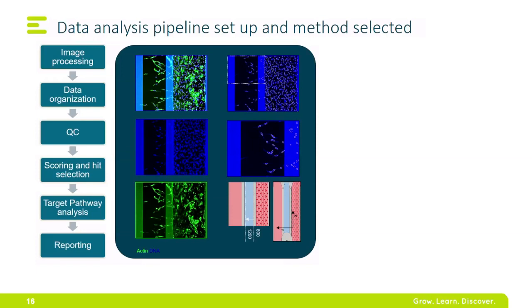On top of that, we also figured out that you have inherent toxicology data in there, because you can look at the main tube as well. If your sprouts are gone, but your main tube is also gone, you are probably not looking at a therapeutic effect but at a toxic effect. So the nice thing is that we could monitor both the efficacy and the toxic effect on the main vessel, which is added value for that assay.